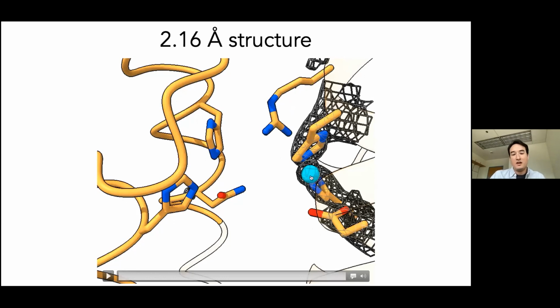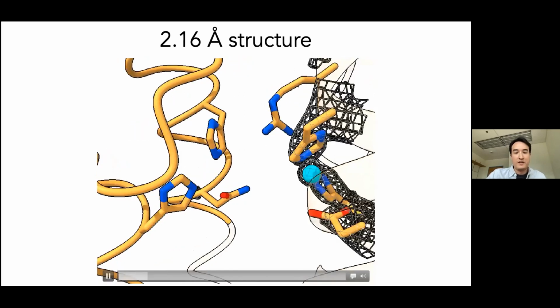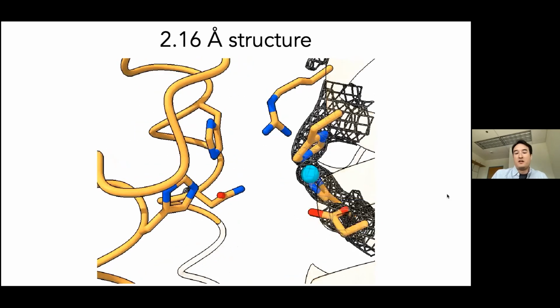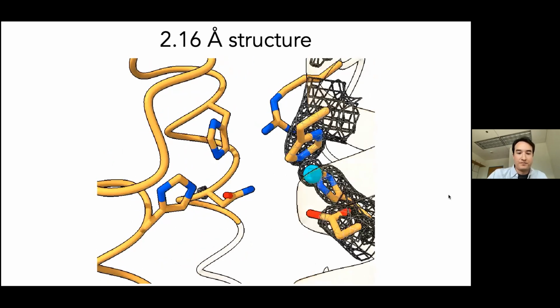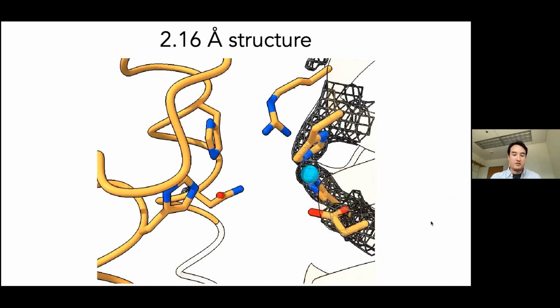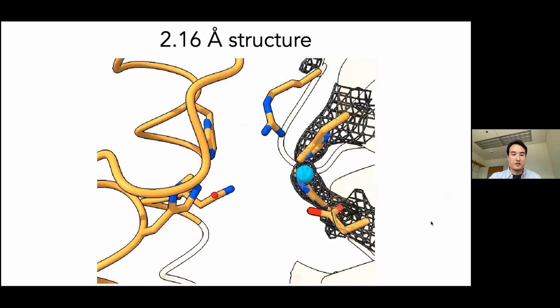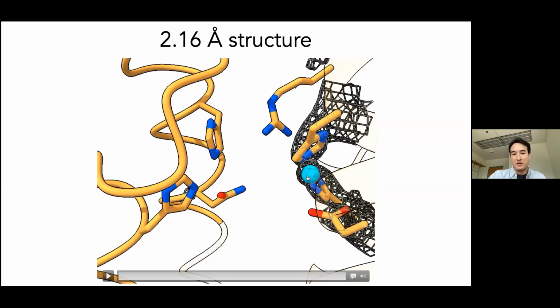and the histidine is now in a coordinating position for this copper C. If you give it a little bit of movement, you can get a better sense of the nuclearity of the site. But notably, what you can tell by thresholding up the map is that the loop is actually unstructured in this particular sample. And so between the crystal structure and this cryostructure, it leads to this correlation of the loop region being disordered and then the copper C site being occupied.